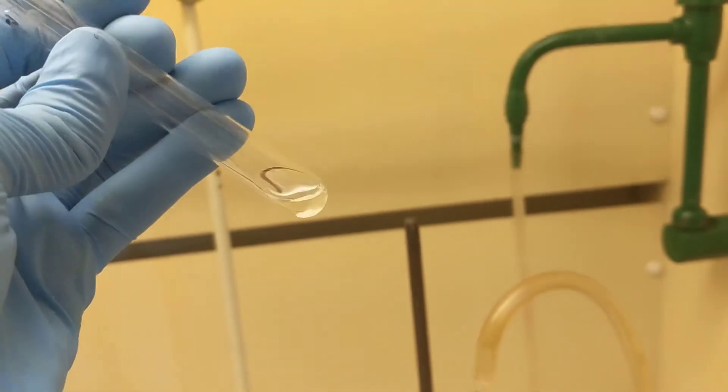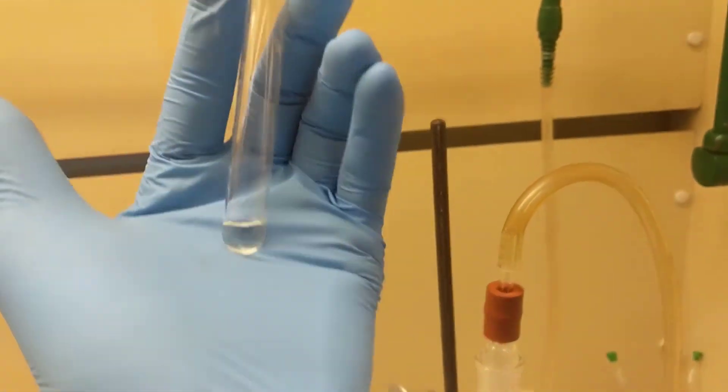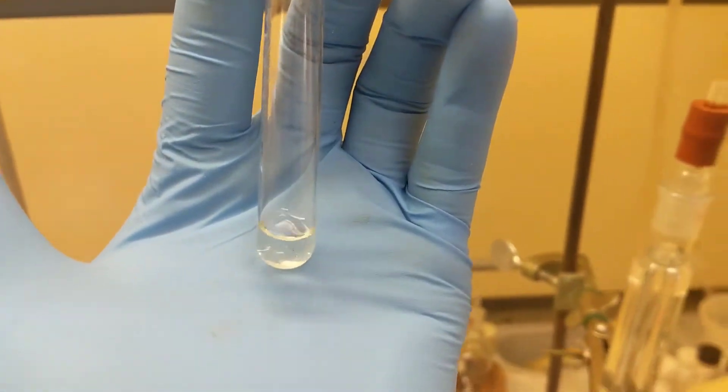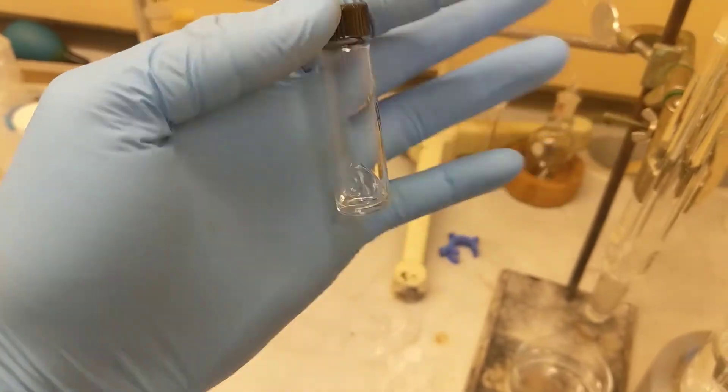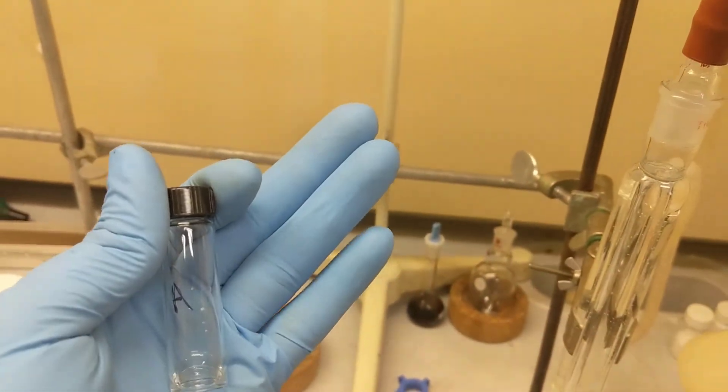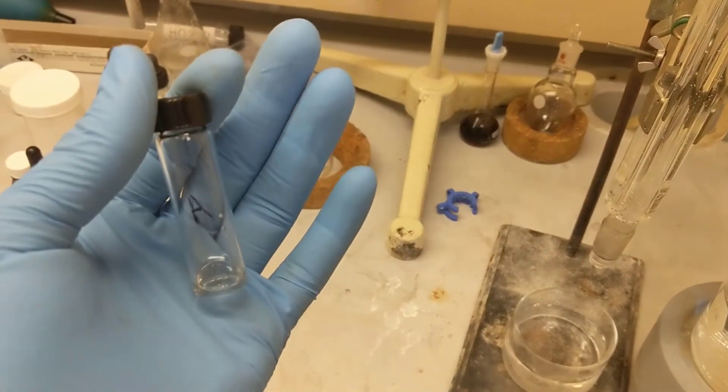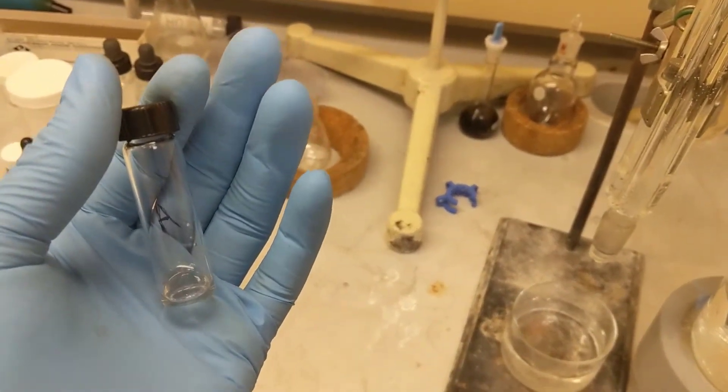Here it is. You can see the anhydrous sodium sulfate down at the bottom. As you can see, it moves freely, no signs of clumping. I think my organic layer is dry, and I'm just going to transfer this into a vial and be done. This is it - the end of Experiment 20A. We have our alkyl halide sitting in here, and I'll have to run this soon.